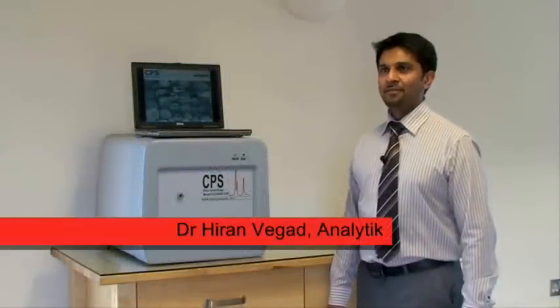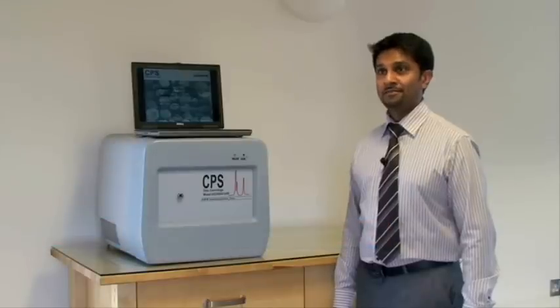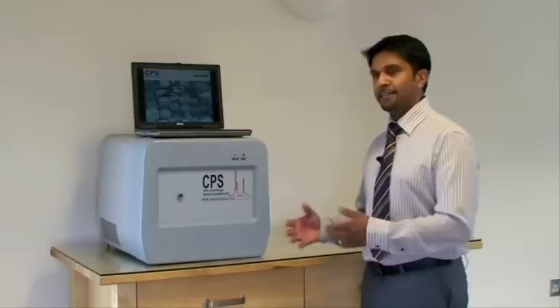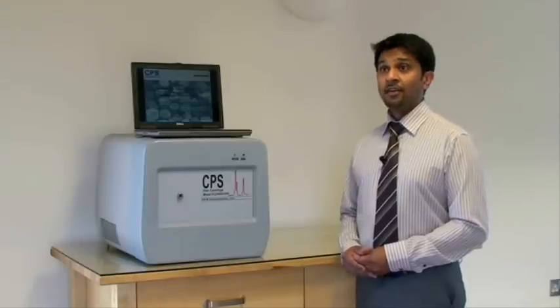Hi, my name is Hiran Vigad and I'm the product sales specialist for the CPS Disc Centrifuge UHR machine. The UHR stands for ultra-high resolution and this instrumentation is used for high resolution particle size characterization using a technique called differential centrifugal sedimentation.